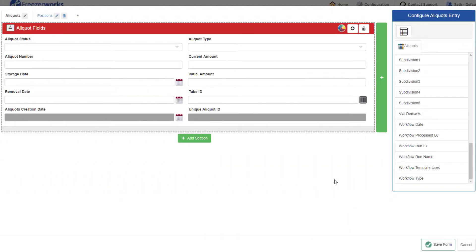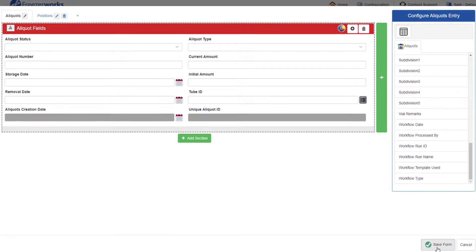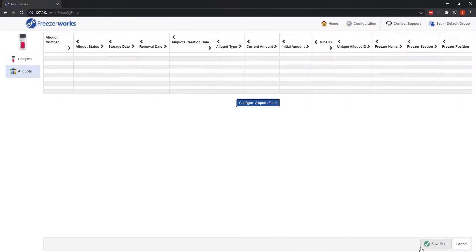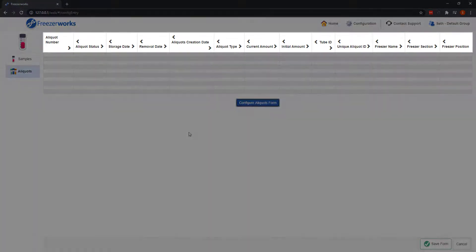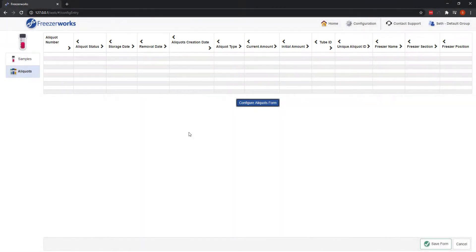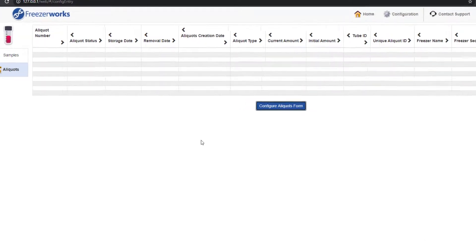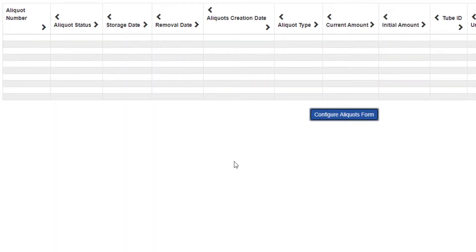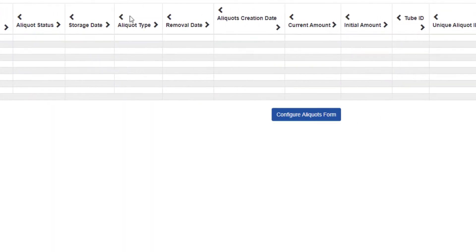Once you've finished designing the look of your aliquots form, click save form to return to the aliquots page of the samples entry form. You'll notice that all of the fields you add to the aliquots form now appear in this list view's headers, just as they do when the entry form is in use. They'll be in the order the fields were added to the form, but if you'd like to change that, click the arrows to the left and right of every header.